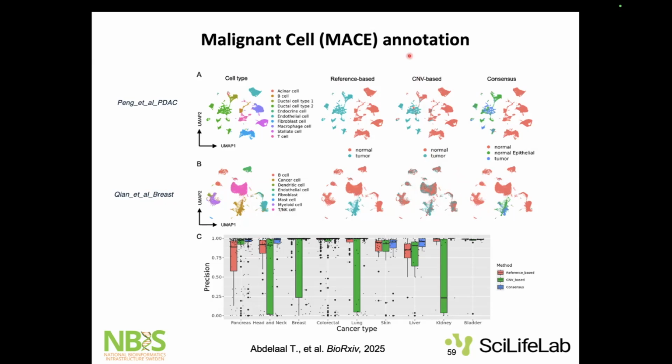But by using reference-based methods, you can really fix that one. So you understand that, okay, that's not the case, and that's because only the CNV signal is low. So you know that one is also very dependent on this cancer cell type.